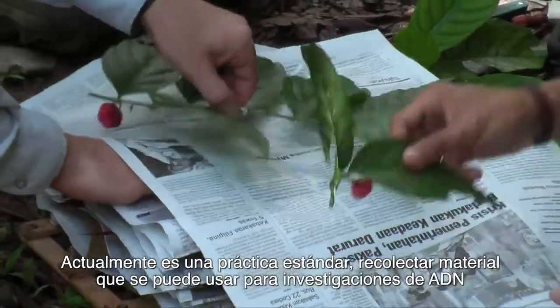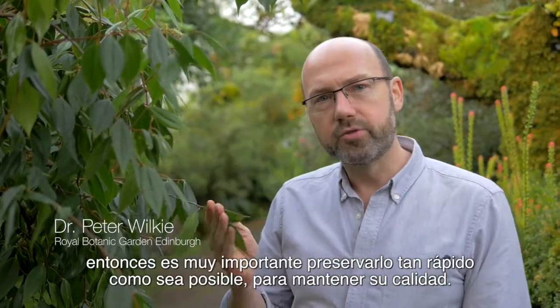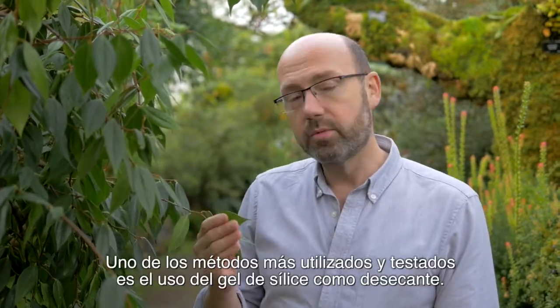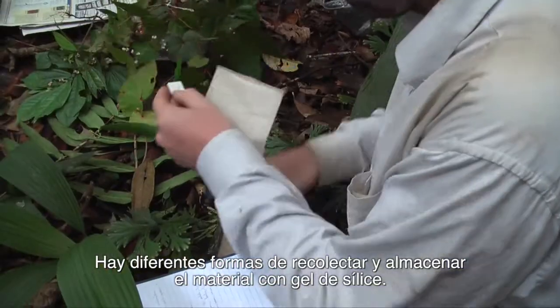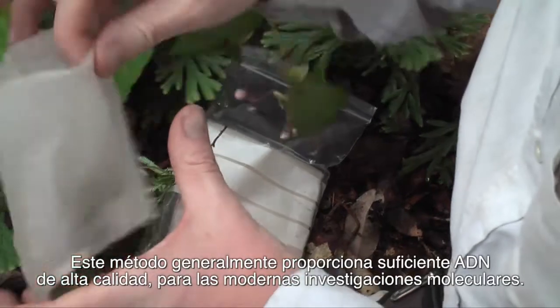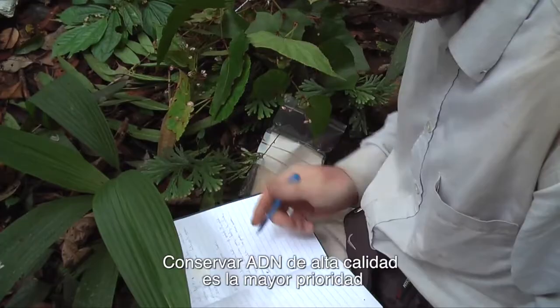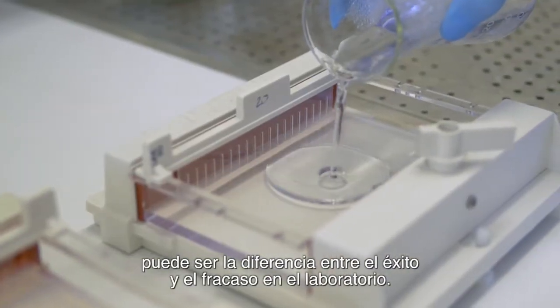It is now standard practice to collect material that can be used for DNA investigations at the same time as you make herbarium specimens. DNA degrades very quickly after picking, so it's really important we preserve it as quickly as possible to maintain DNA quality. One of the most tried and tested methods is using silica gel desiccant. This method usually provides DNA that is of high enough quality for modern molecular research, and keeping the DNA high quality is a major concern — it can be the difference between success and failure in the lab.